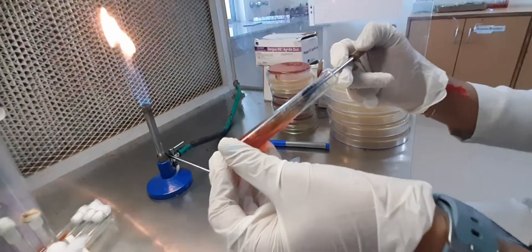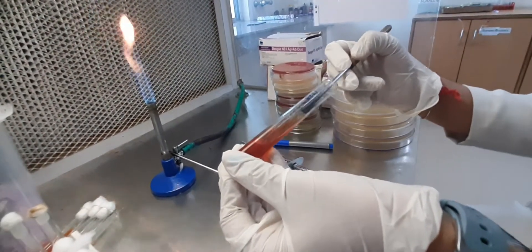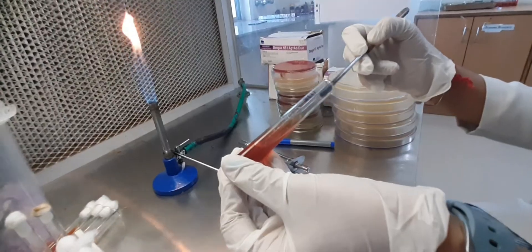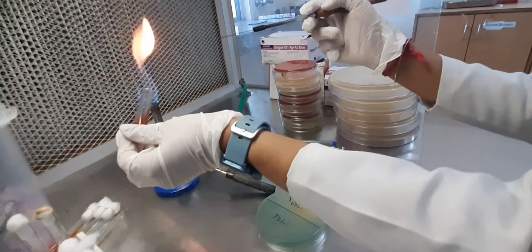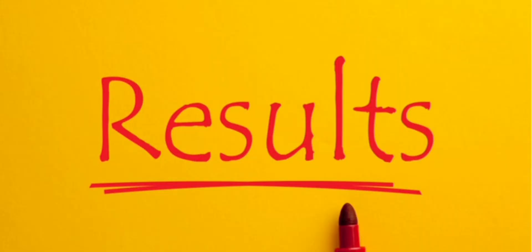Inoculate the SI by first stabbing through the center of the medium to the bottom of the tube and then streaking the surface of the agar slant. Leave the cap on loosely and incubate the tube at 35-37°C in ambient air for 18-24 hours.